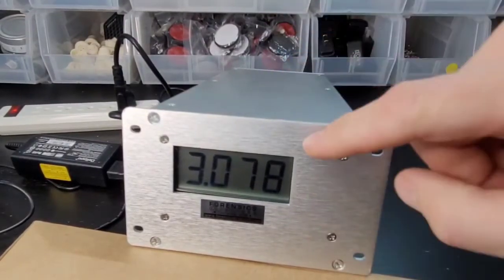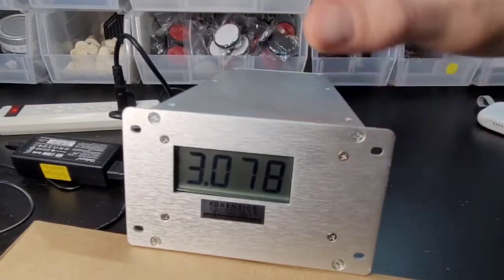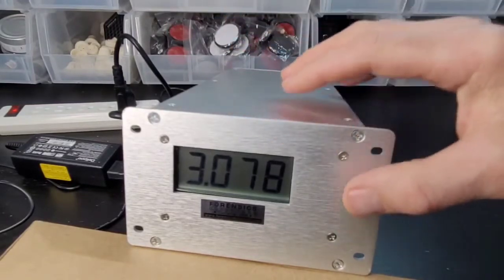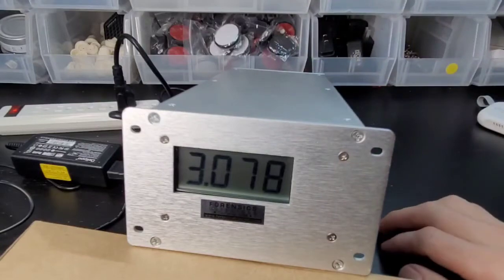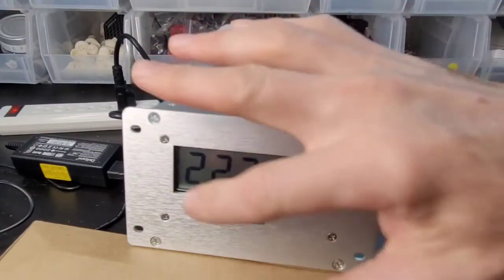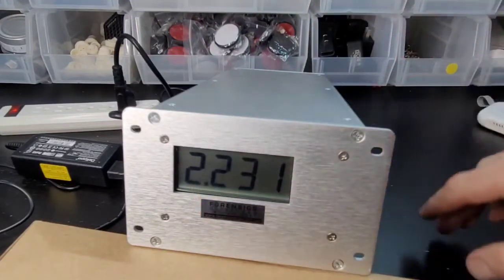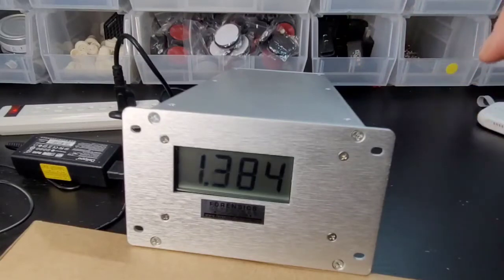So if we've come to this point, you could feel confident that the analyzer is functioning as we have shipped it out from our labs in Los Angeles at Forensics Detectors. Again, this will be coming down to a baseline of 0 once it evacuates that ozone air that's within the system, and then it'll be reading 0.